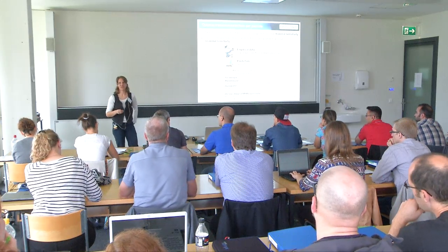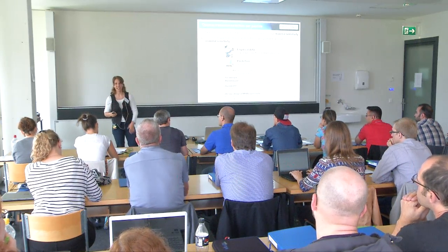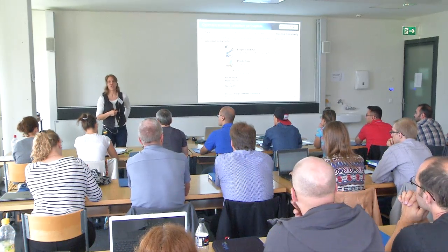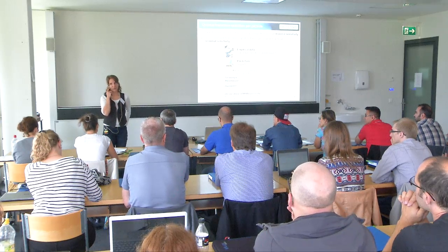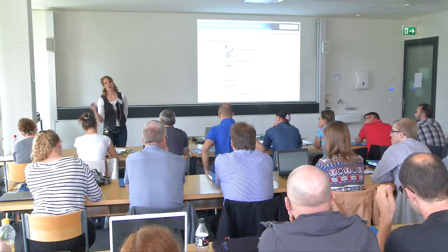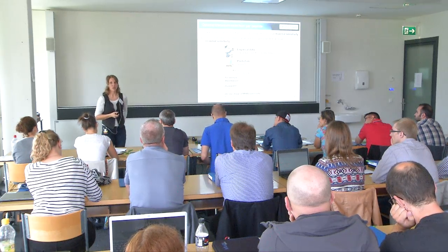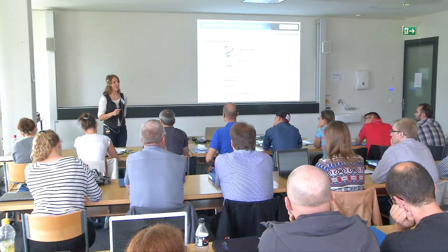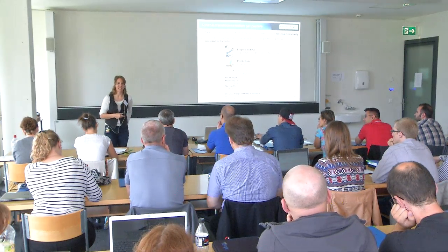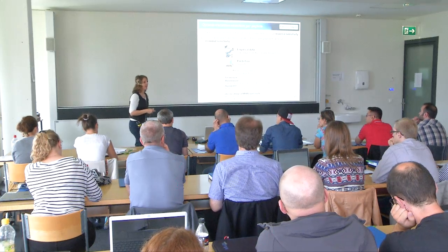It's not a complete comprehensive study, but I know the paper and I know it from own experiments. This is definitely true. So if you generate data on an Orbitrap in HCD mode and you want to use it for your SRM measurements on a triple quad, you get a better fragmentation similarity. But also Arjo will come back to this and explain a bit this afternoon in his lecture. You will hear more about that.